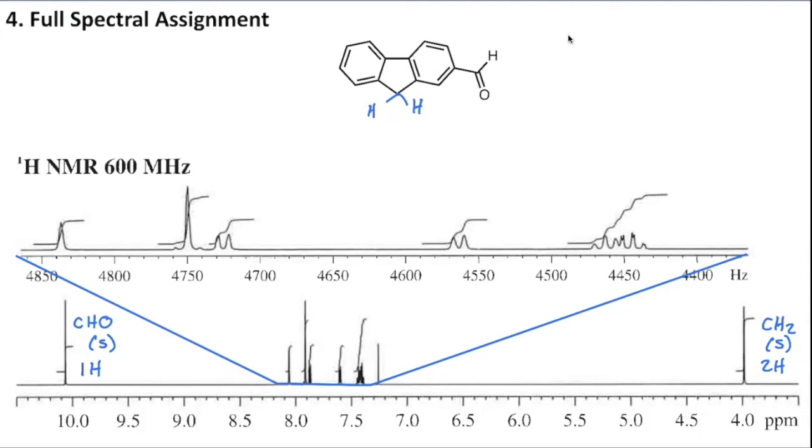That's really great. You may go through these and have absolutely no idea what any of the protons are to start, and that's okay. You just have to work through the pieces as they come up and start to make more sense to you. Luckily, this one had a couple of easily identifiable pieces that we can use as handles for us to figure out the other ones that are much less clear. So now let's dive into this zoomed in region here, keeping in mind that all of these are somewhere between 7 and 8. We don't have the ppm values nicely picked out on the top spectra, but we can kind of roughly read them from the bottom spectra when we want to refer to them later.